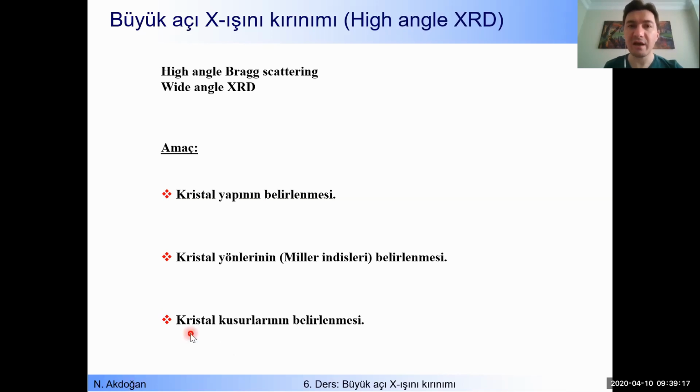In addition to that, this method is non-destructive. So you investigate your material and it is not destroyed. It is very important. So very helpful, very fast, a very accurate method.